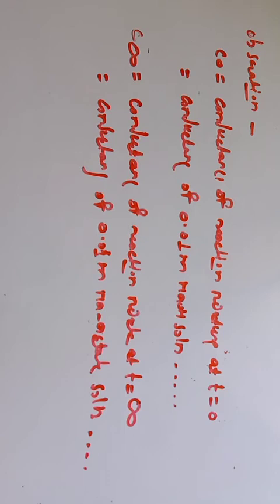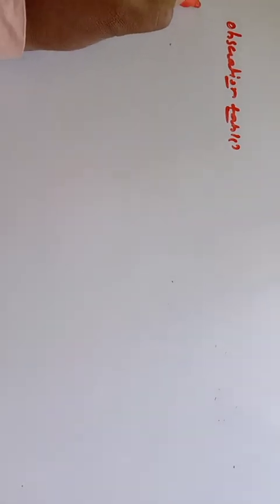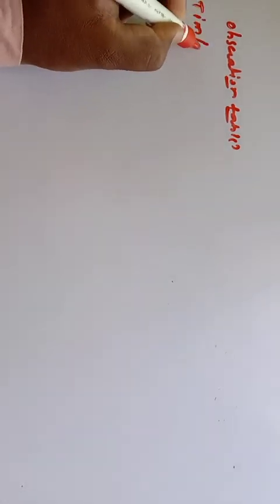So let's discuss the observation table. If you consider the observation table for this experiment, it contains time in minutes.